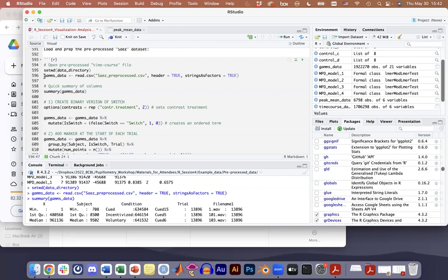Are you sure it's not the code you're running? I'm pretty sure because I checked to make sure that R is finding the right file. Oh, mine says yes, I can find the file. Mine is good. Okay. Maybe try re-downloading it, right? Yeah. Oh, I didn't get this error, that's the thing.